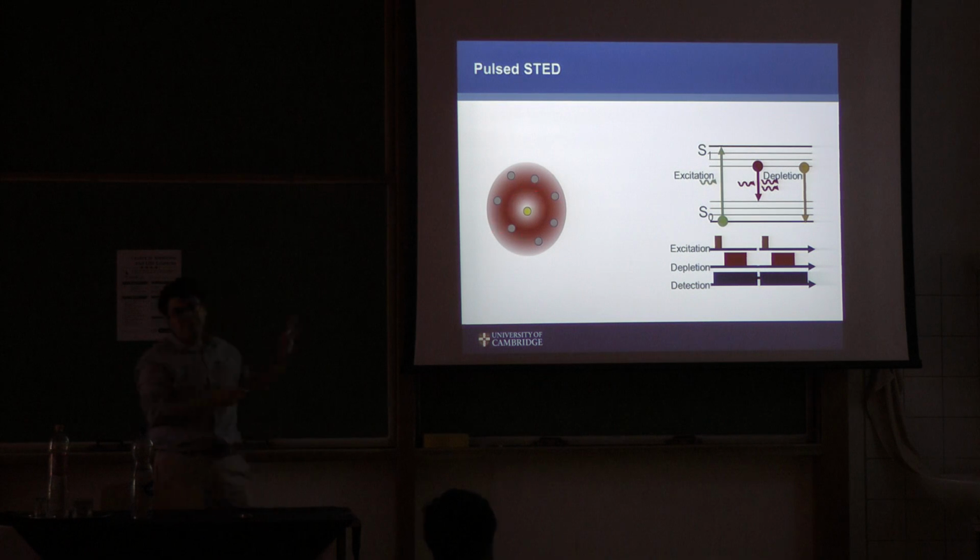So you illuminate your sample with the green diffraction-limited beam, and then you arrange the optics of the system to produce what I put here as a red beam. And the effect of the red beam is that it drives what's called depletion, so that your fluorescent molecule is intended to detect the fluorescence which comes when you illuminate your sample with green light.